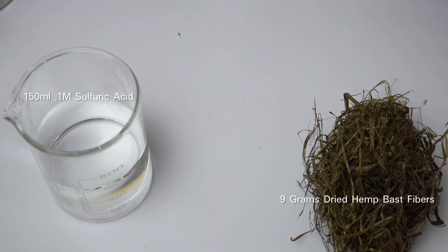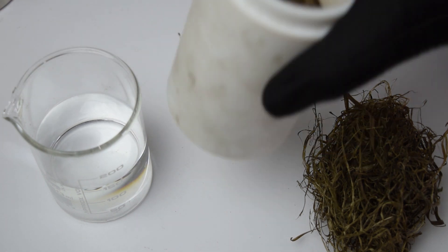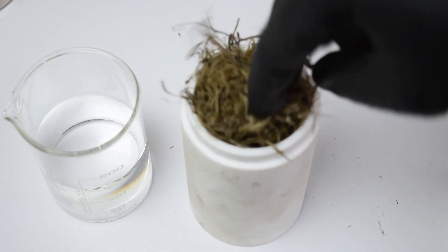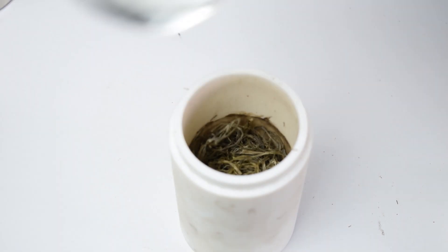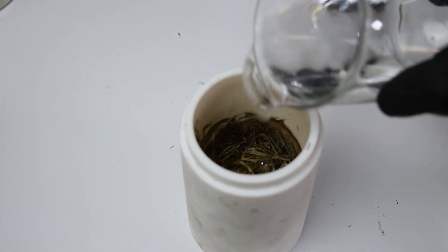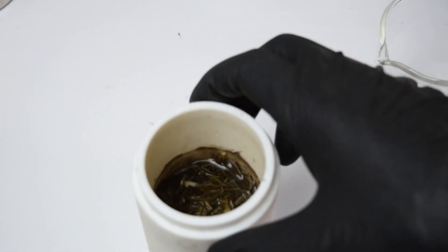9 grams of dried hemp bast fibers are combined with 150 milliliters of a 0.1 molar solution of sulfuric acid in a hydrothermal autoclave. You just need enough solution to submerge the bast fibers.